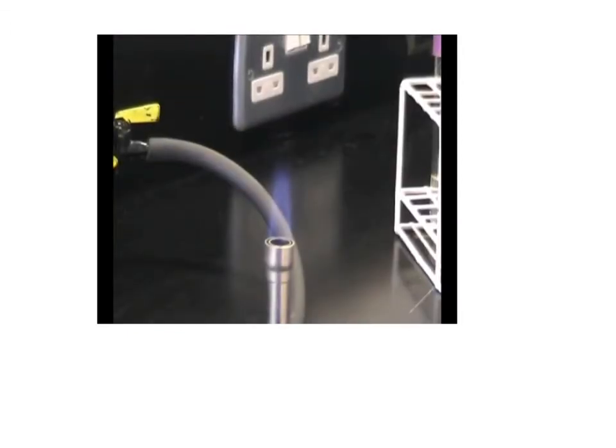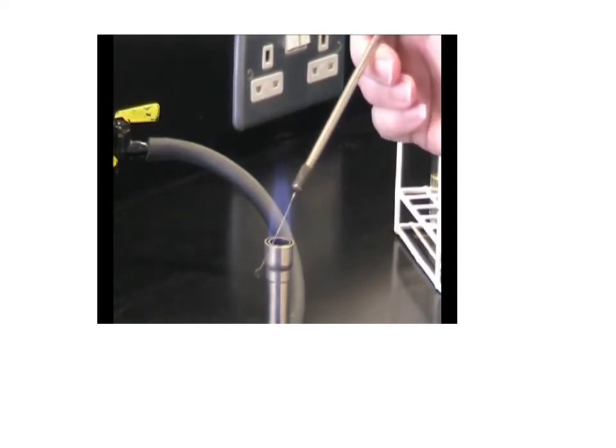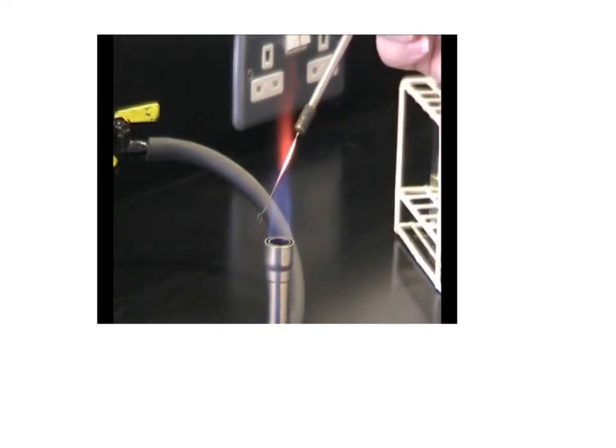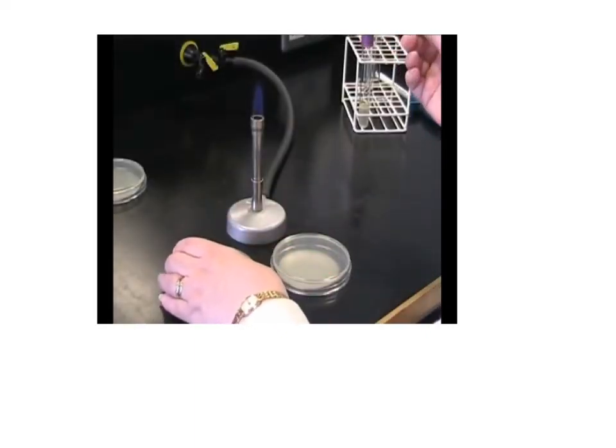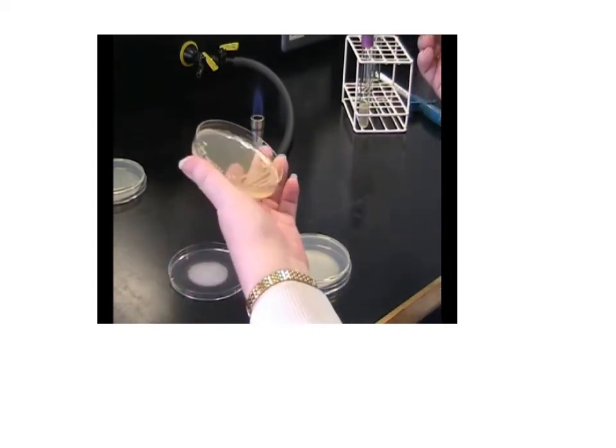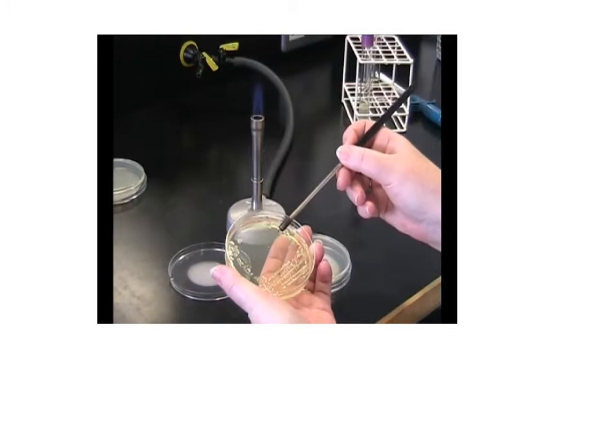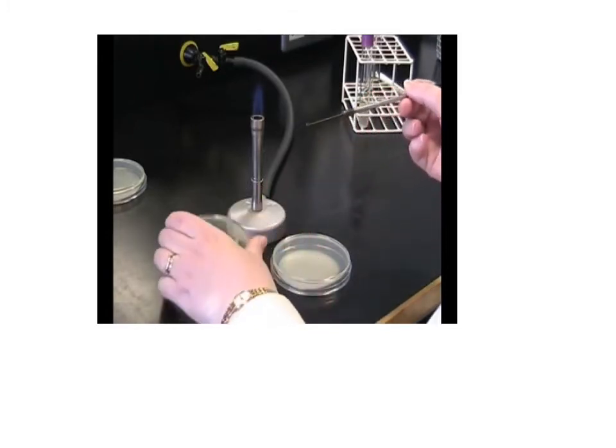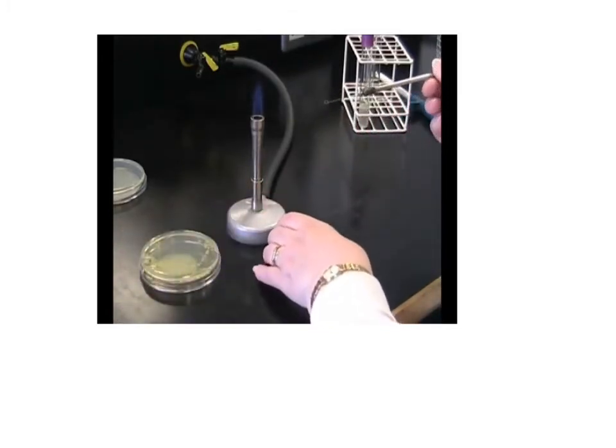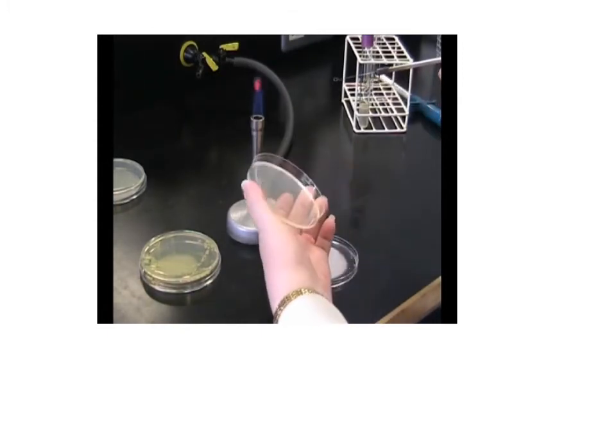When you want to use it, open the air hole and you'll get a nice bright blue cone of gas. Before you start work, sterilize your loop. Pass your loop through the flame, pulling it up through the top of the blue cone until it goes red hot. Remove it and allow to cool. Do not put it down on the bench. Using your flamed and cooled loop, take a plate and remove an isolated colony.